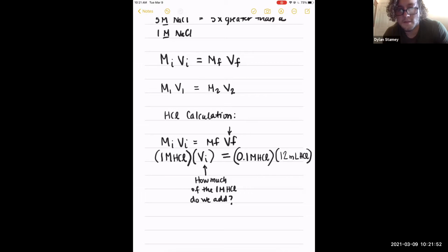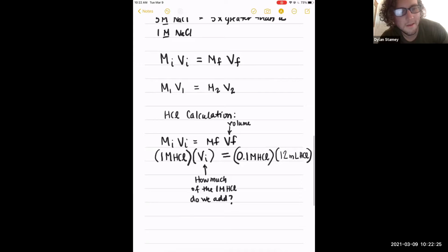What did the V stand for again? I'm sorry, Dylan, for some reason I can't hear you. Just a second, it's me. So sorry, Dylan, try it again. What did the V stand for? The V? Yes, on the MFVF. Yeah, so V is volume. Oh, okay. And this is molarity or concentration. Great question. Anybody else with questions about the setup before we do the calculation?